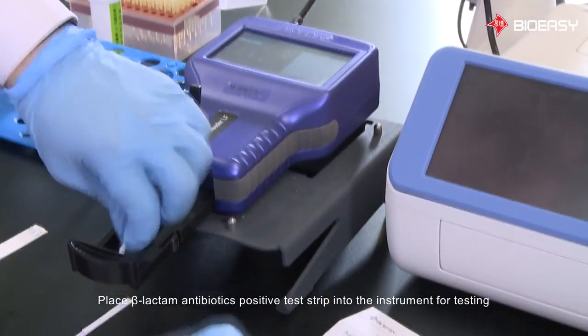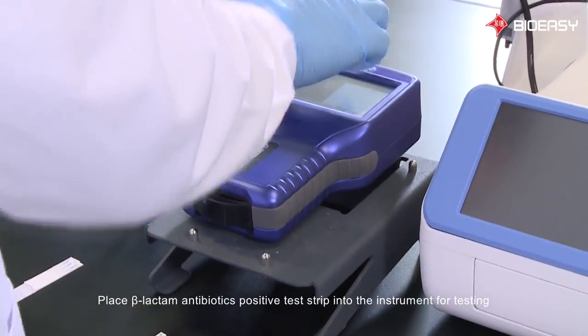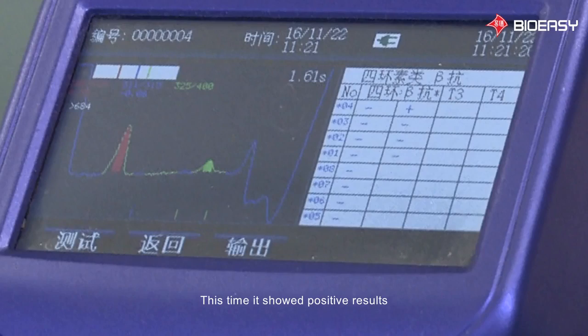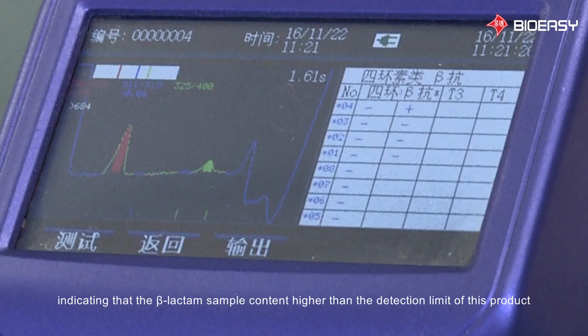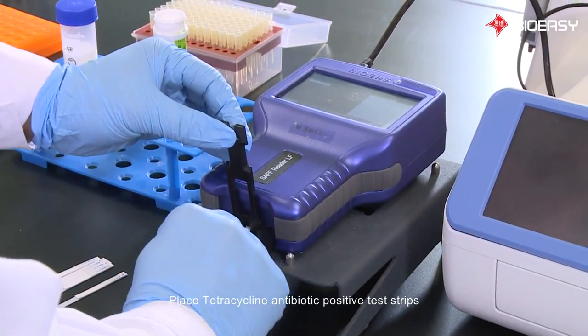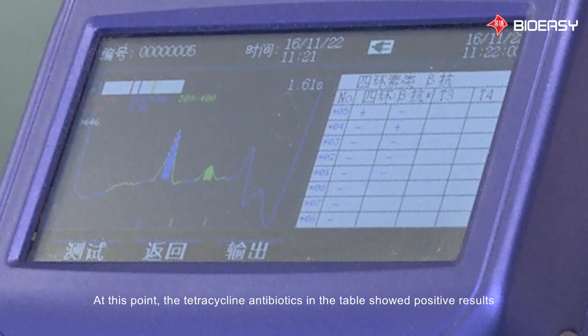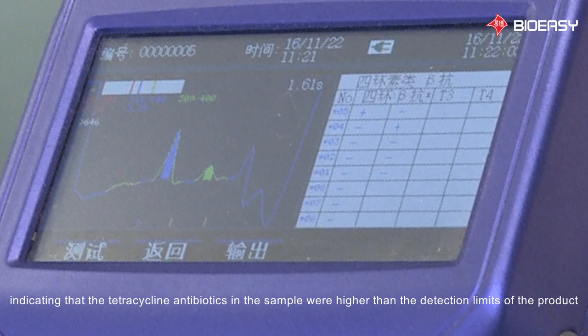Place the beta-lactam antibiotics positive test strip into the instrument for testing. This time it showed positive results, indicating that the beta-lactam sample content is higher than the detection limit of this product. Place the tetracycline antibiotic positive test strip. At this point, the tetracycline antibiotics in the table showed positive results, indicating that the tetracycline antibiotics in the sample were higher than the detection limit of this product.